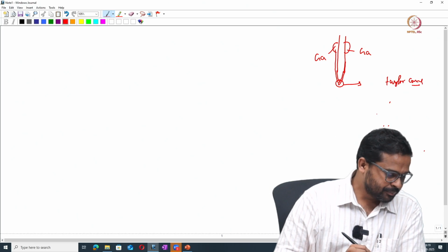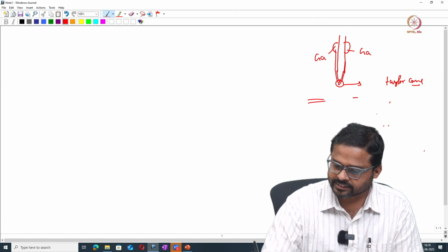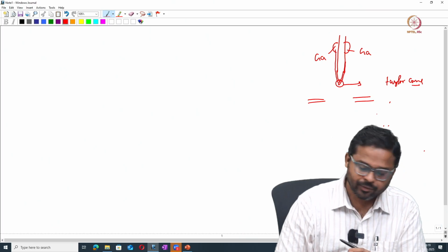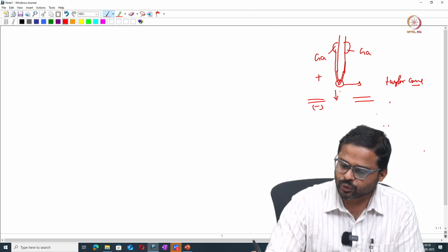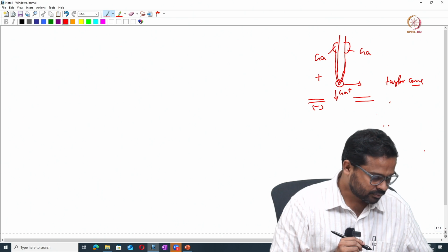okay, and usually the electric field, so you will have extractor plates, correct, and this electric field pulls the gallium ions. The extractor plates have negative potential, you keep the positive potential, so your gallium ions get pulled from this Taylor cone.